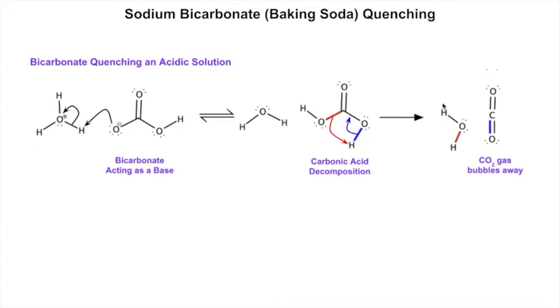A lot of things you dissolve in water, the solids have bicarbonate, not hydronium necessarily, but like a citric acid, something like that, that will cause this carbon dioxide reaction to occur. And when you're done, you have a lot less hydronium in your solution, so your pH goes closer to 7. So you've neutralized it, quenched it.